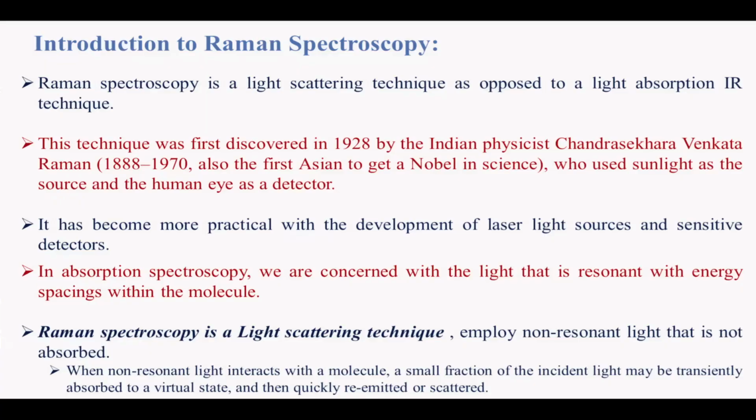Because nowadays a super-resolution spectroscope comes into the market within 10 years. Whatever happens in the lab, if that work is recognized by somebody like the Nobel Prize Committee, it comes to the market almost immediately, within 5 years or so. But at that time, imagine, for 30 to 40 years nobody was using it, because Raman spectroscopy has some inherent problem.